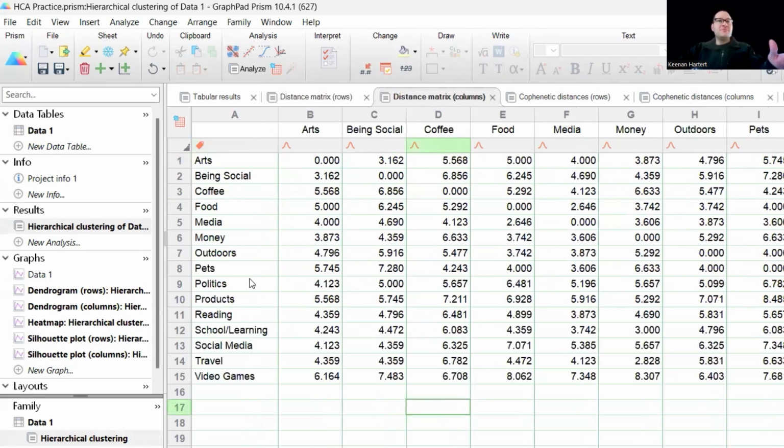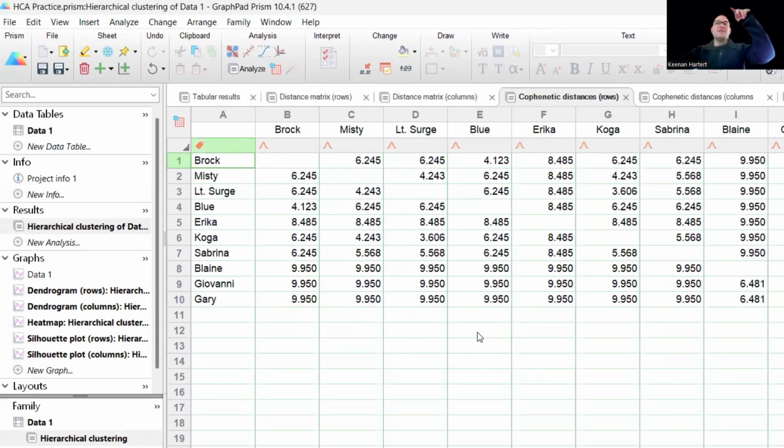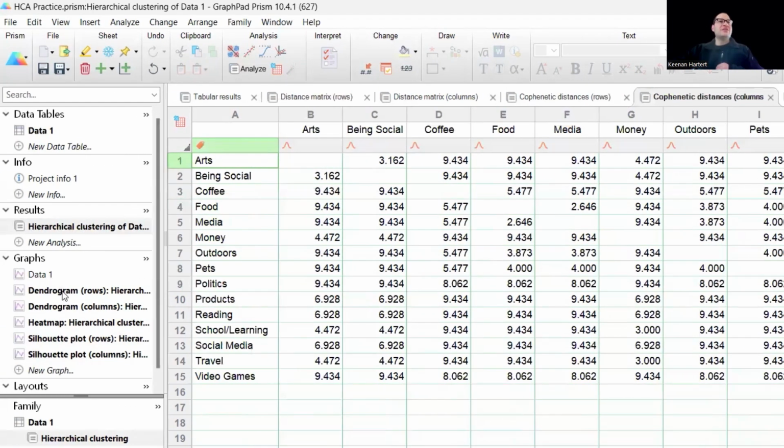The same is going to be said right here for all of our factors that we just looked at. You can start to see, what are the distances here? Cophenetic distance as well. How far away in a cluster are some of these things from more of a height perspective? So in that case, let's go ahead and look over here at what we're talking about.